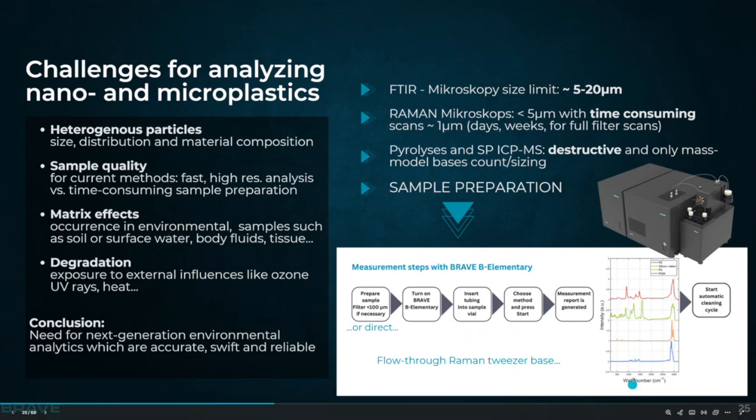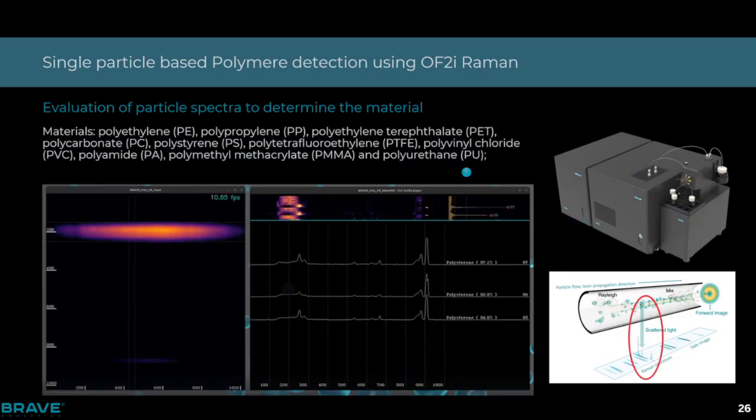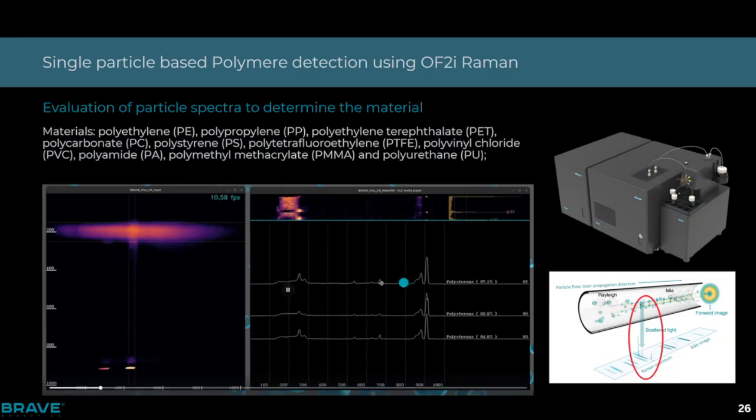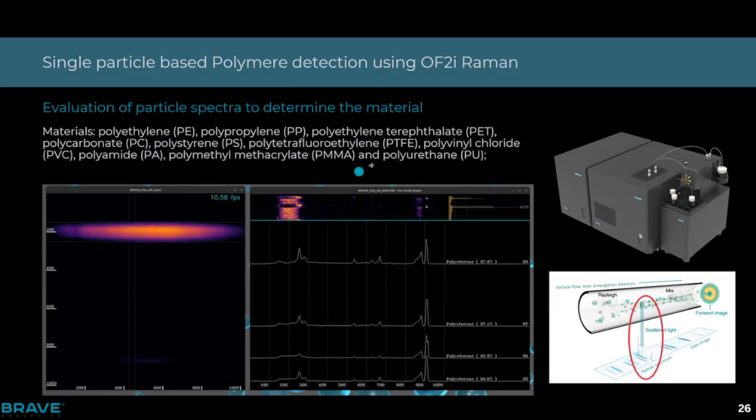You generate different outcomes. This is, for example, where we measured different samples, with different particle systems, to really generate all these different outputs. And we also knew that not only the spectra need to be measured, but you also need more information on what kind of spectra.